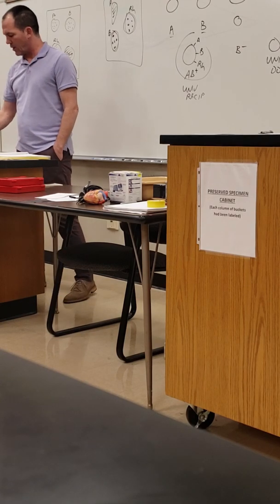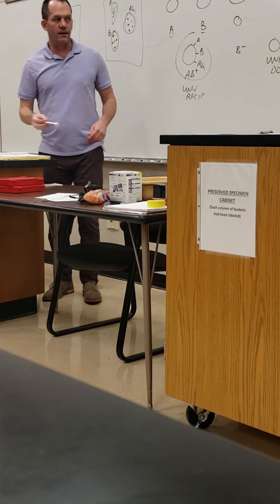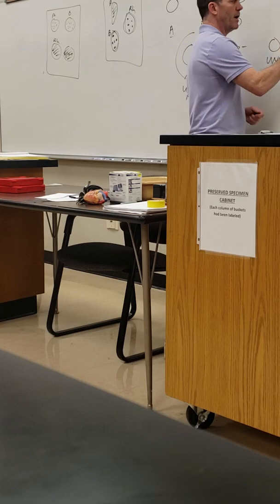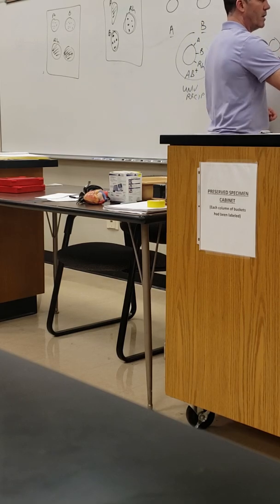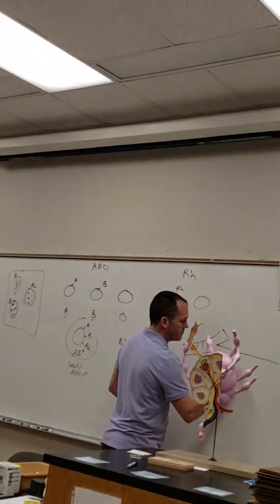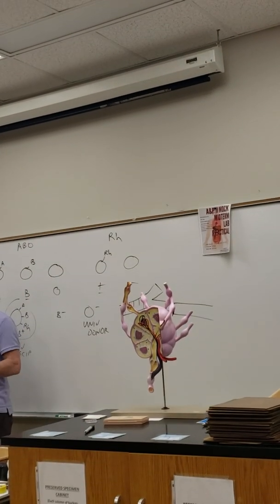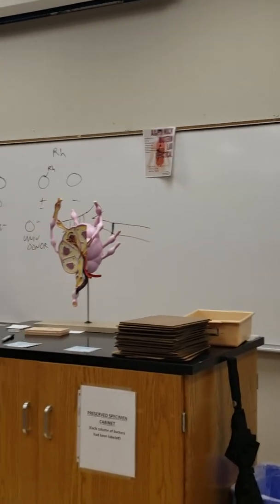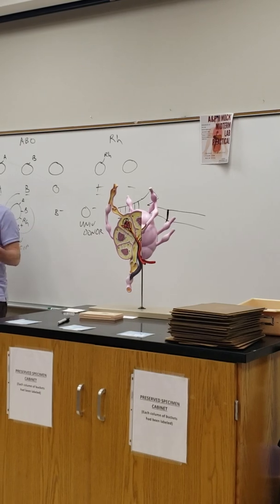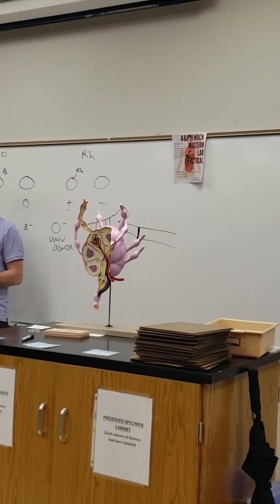So there's 1 slide of cardiac muscle, which you're looking for what? Intercalated discs. So if you see a heart muscle with striations and maybe some branching, and then another cell over here, and there's a dark line there, that indicates that that's cardiac muscle. We're not going to be looking at skeletal muscle. You might see some smooth muscle.